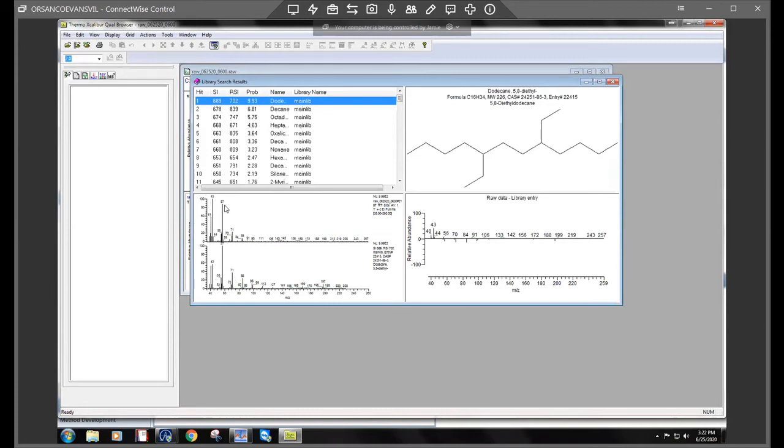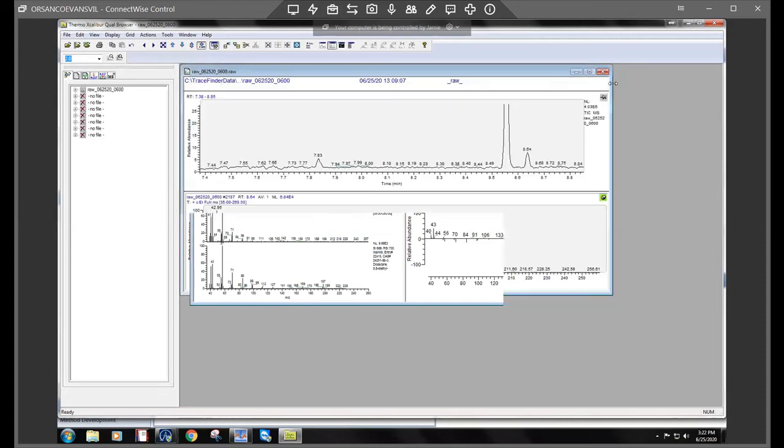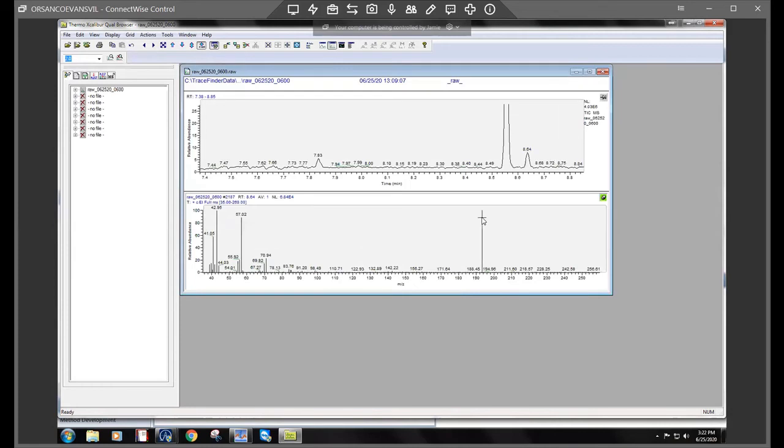So sometimes what could happen though is the software gets bogged down with the background noise. So one thing you can do is subtract it out.